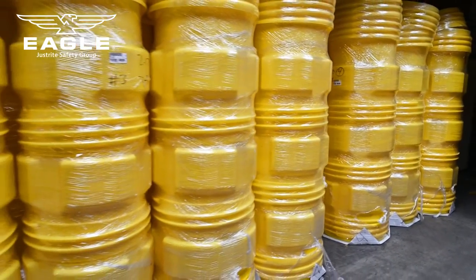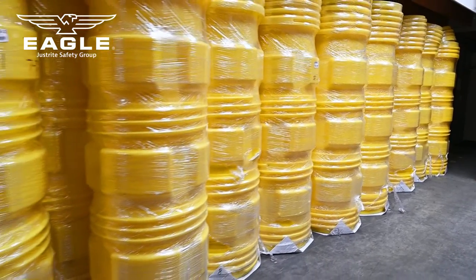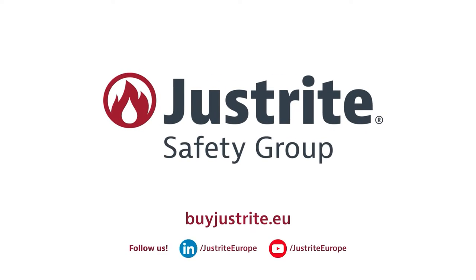If you are in an industry that deals with hazardous materials, it is crucial to invest in an overpack or lab pack poly drum to ensure the safety of your employees and the environment. If you'd like to know more about our spill containment and material handling solutions, please visit us at buyjustright.eu.